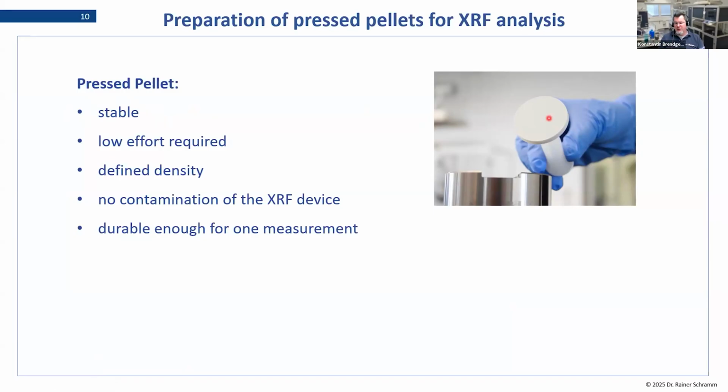When it comes to the X-ray side of the analysis, you always have to choose the atmosphere. And vacuum is ideal, but when it comes to liquids and also to loose powders, using vacuum is not a good idea because it evaporates. So what you want to use then is helium or air as a protective atmosphere when dealing with a loose powder. At least that is how we handle it.